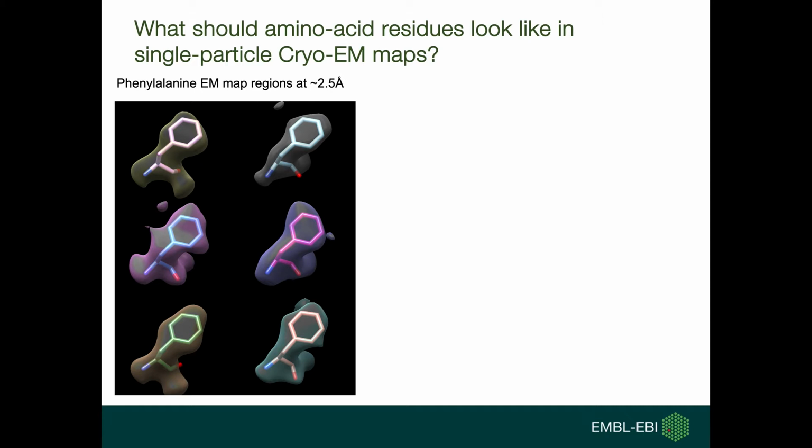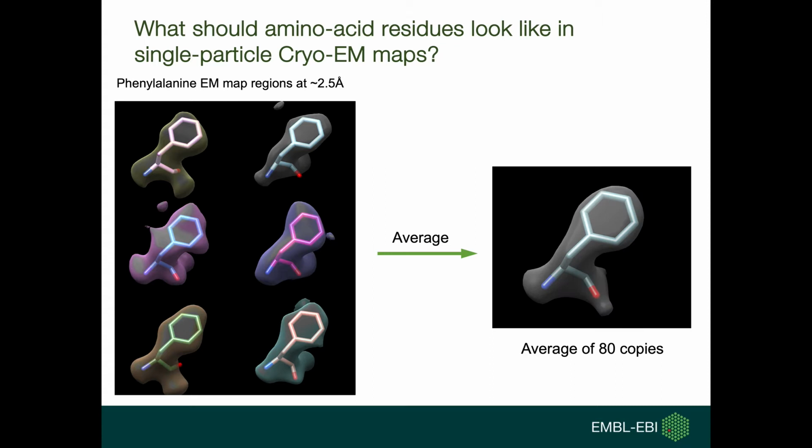But if we have several images of the same thing, then by careful alignment and averaging, we can increase the signal-to-noise ratio and produce a better quality image. In this case, we have averaged 80 images. It is easy to notice that the resulting image is much less noisy.